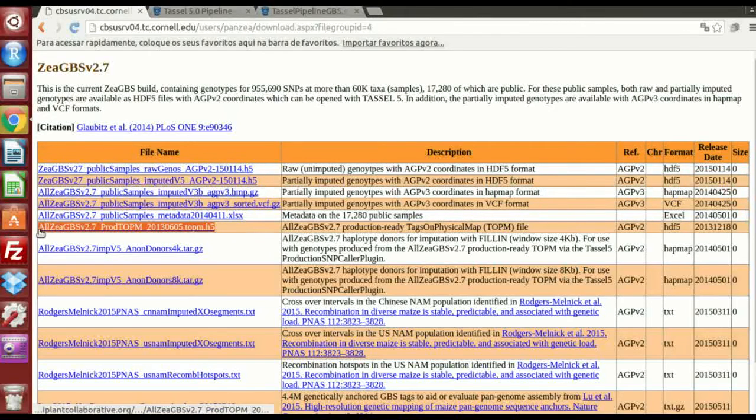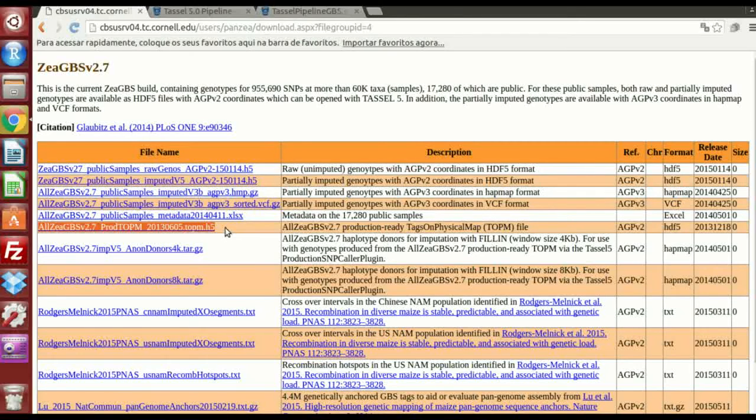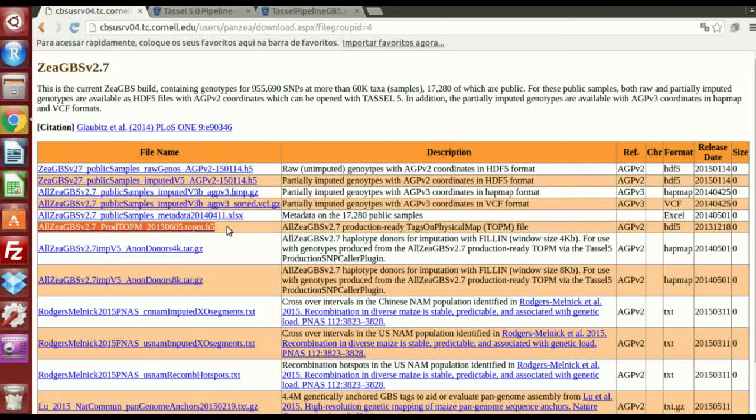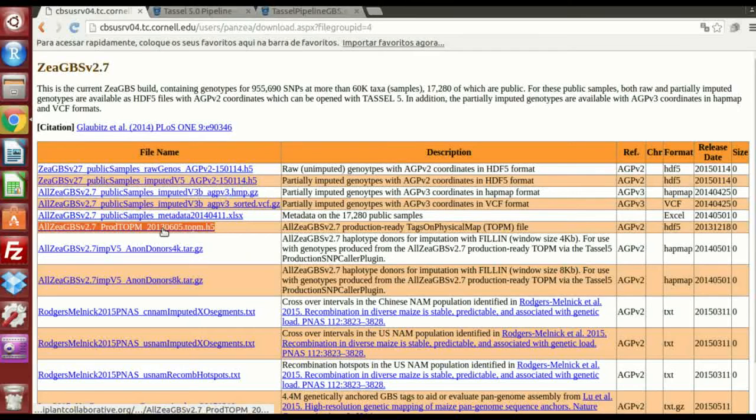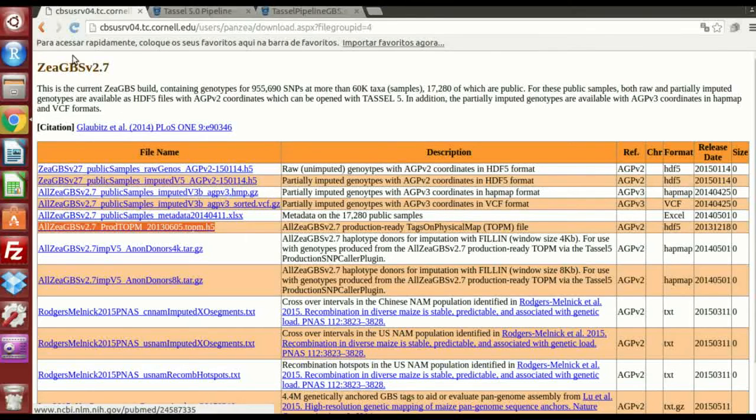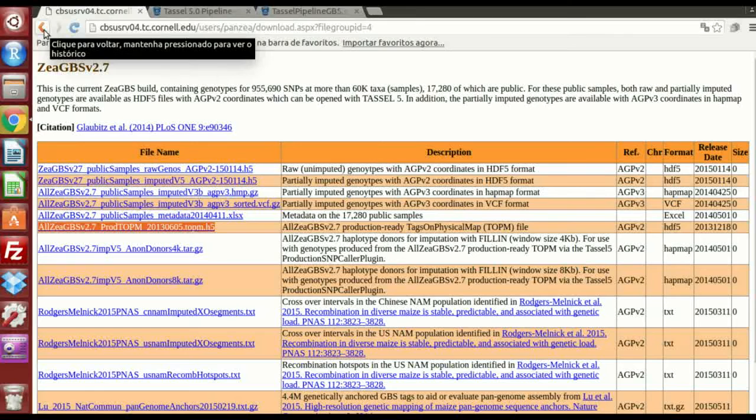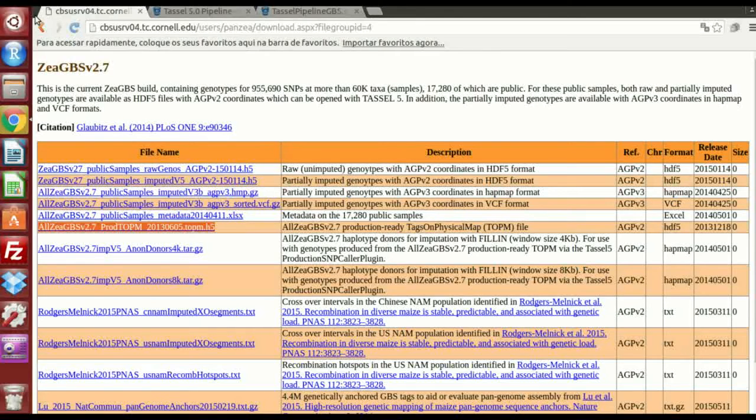Here you have the file you want. This that I'm highlighting. You have two ways of running GBS, one of those is the discovery pipeline, but in our case, with Maize, we just do the production SNP calling. You're gonna download this file. And the iPlant platform would be the most recommended.